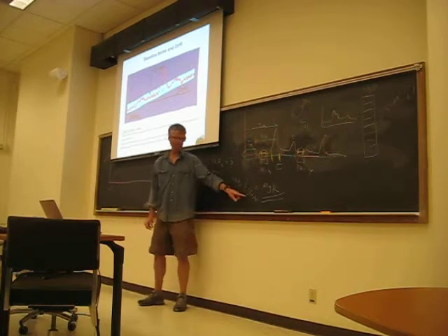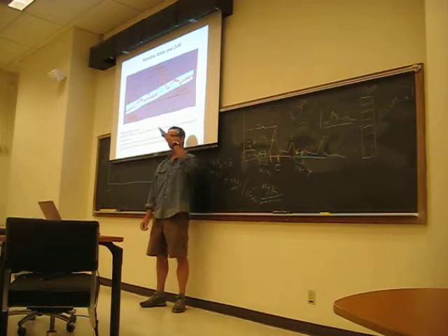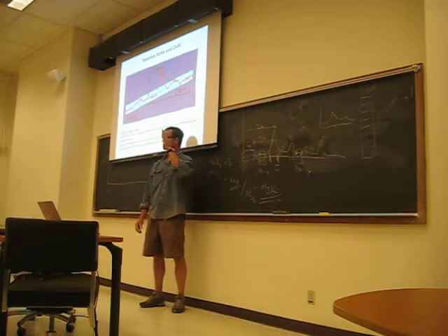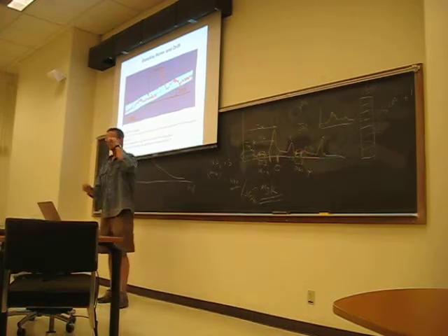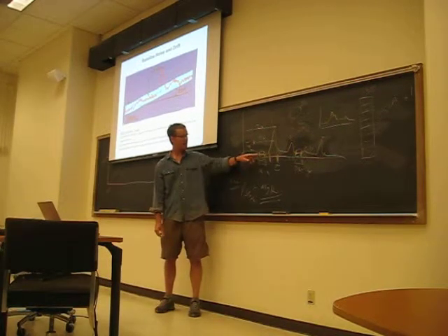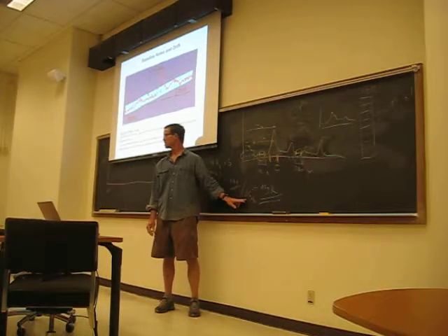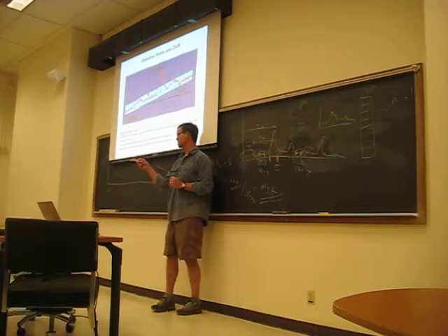Then I'm going to divide those by a slope that's different for each analyte, right? Because I'm getting one slope for my chloride, one slope for my sulfate, one slope for nitrate, or whatever. So they all have different slopes from my standard curves, because in your report, you're going to have one graph for each analyte for your standard curve, right? And you'll get one slope for each analyte. And then you'll divide that number by the slope for each of those analytes. And so you'll get a detection limit that will vary for each analyte depending on what the slope was for that analyte. Is that what you were asking?